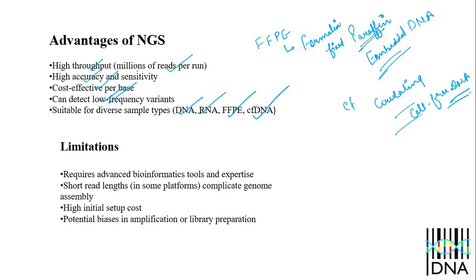But there are some limitations of this NGS. It requires advanced bioinformatics tools, has short read length, high initial cost, and potential bias in amplification and library preparation. Okay, these are the limitations.